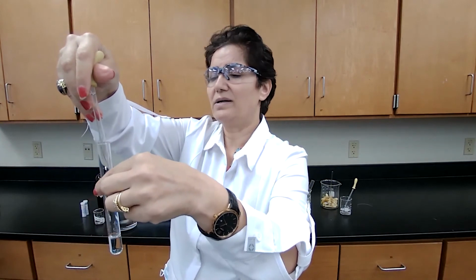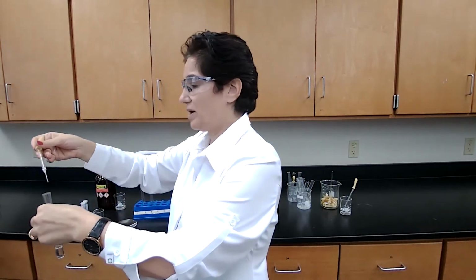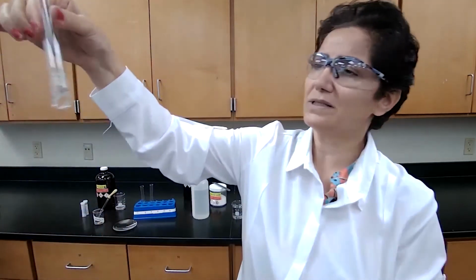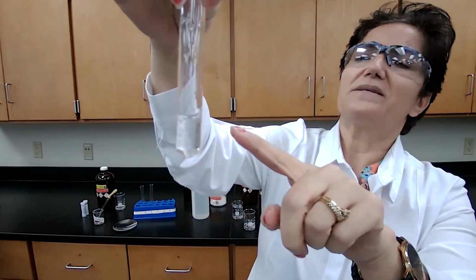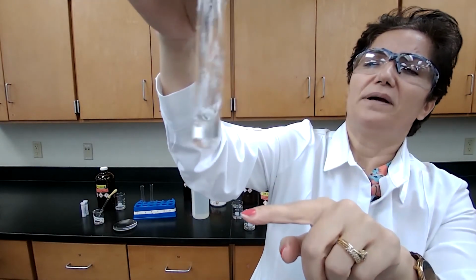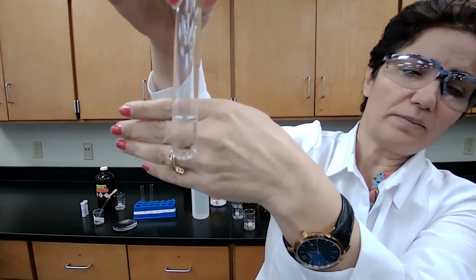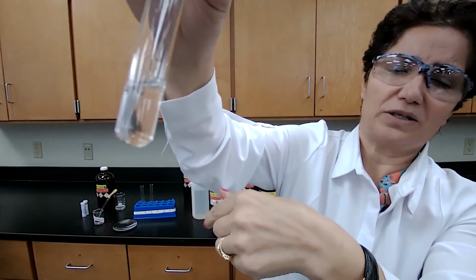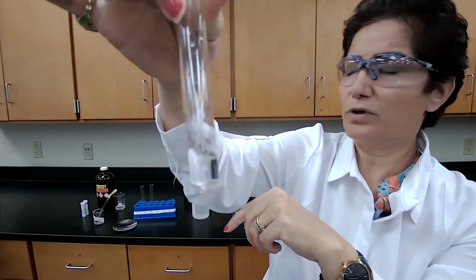I would add a few drops of the unknown. And again, because of the camera, I'm just going to add extra drops and see if it's soluble or not. And if it's not soluble, then it would be thick enough for you to see it. I would shake it vigorously and wait. Okay, see, droplets of the oil is going down and coming up. A second layer is formed. So you record your observation based on how many layers are formed, if it's soluble or not soluble.